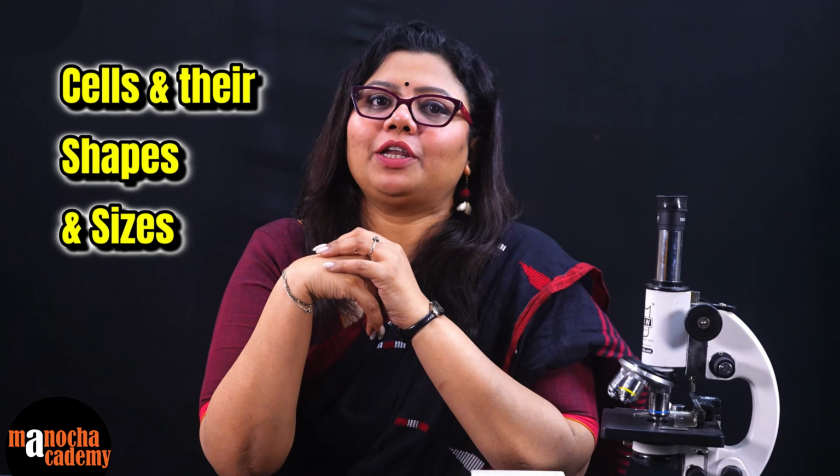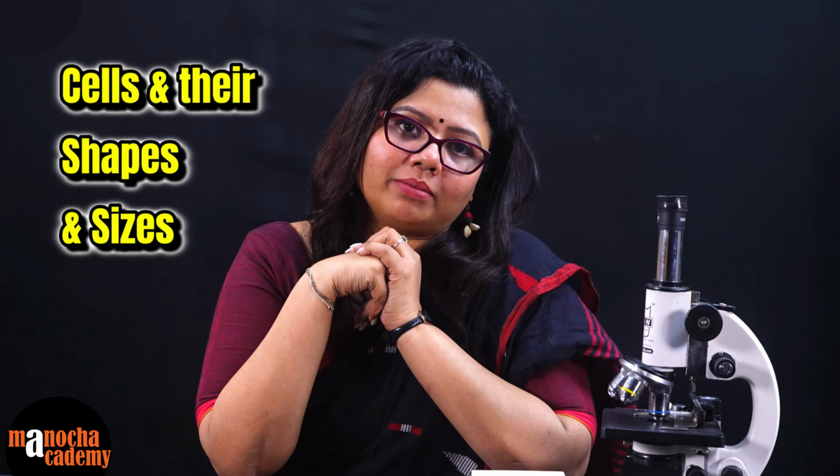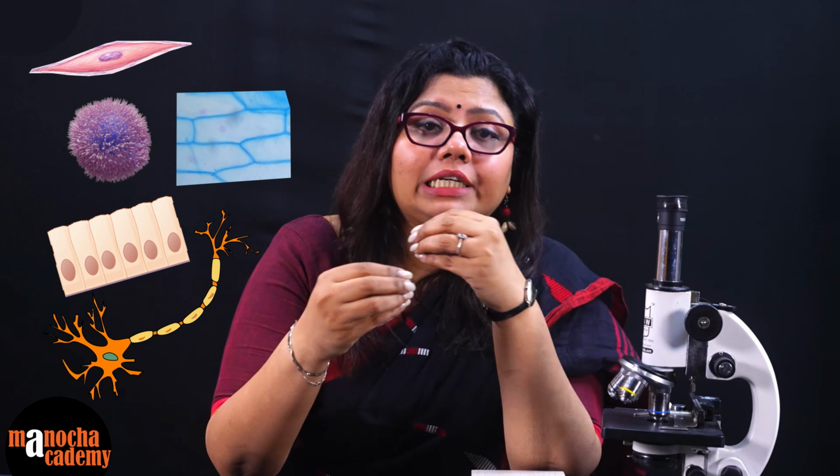Today we are going to look at cells. I'm sure all of you have heard about cells and you know what they are. But you have also known that cells can be of different shapes and sizes depending on the work that they perform. So they can be spindle shaped, they can be round or oval, they can be rectangular, cuboidal, elongated, star shaped and whatnot.